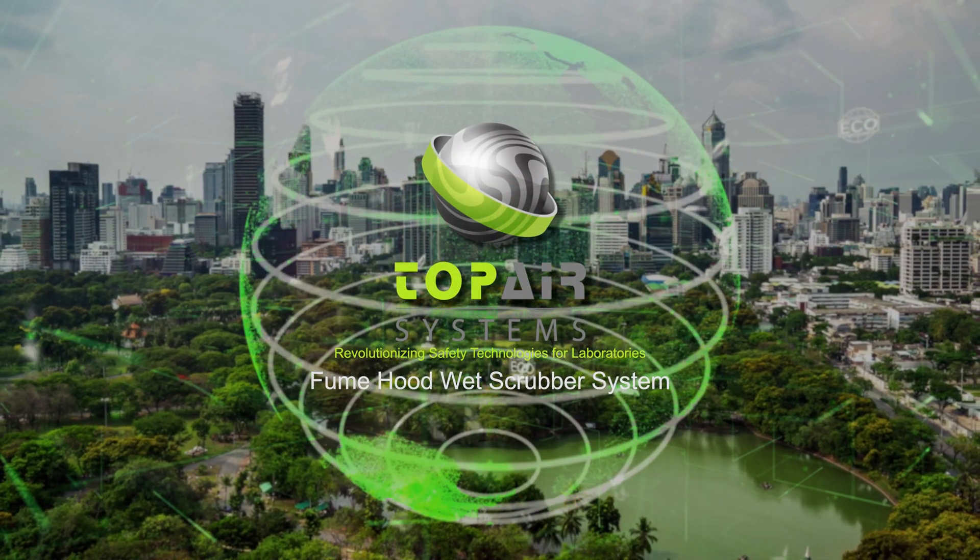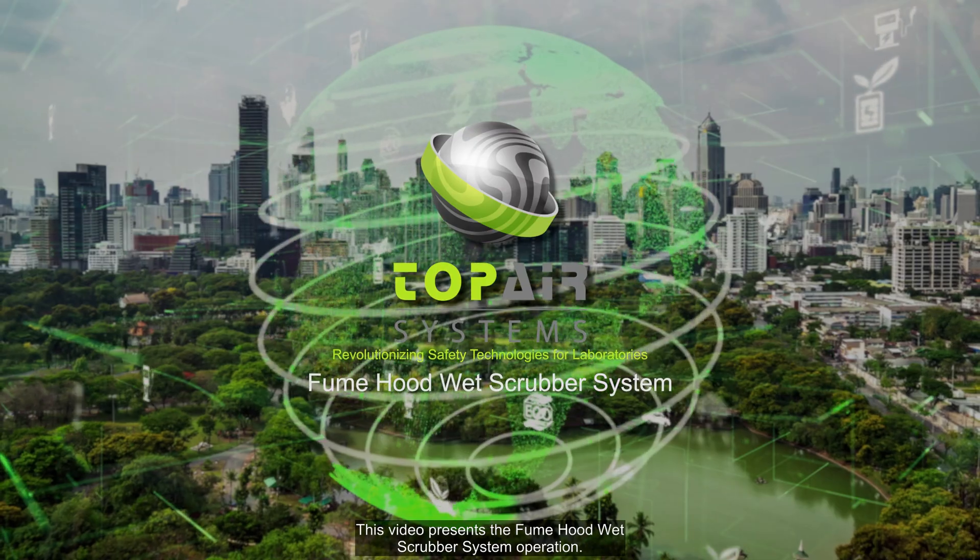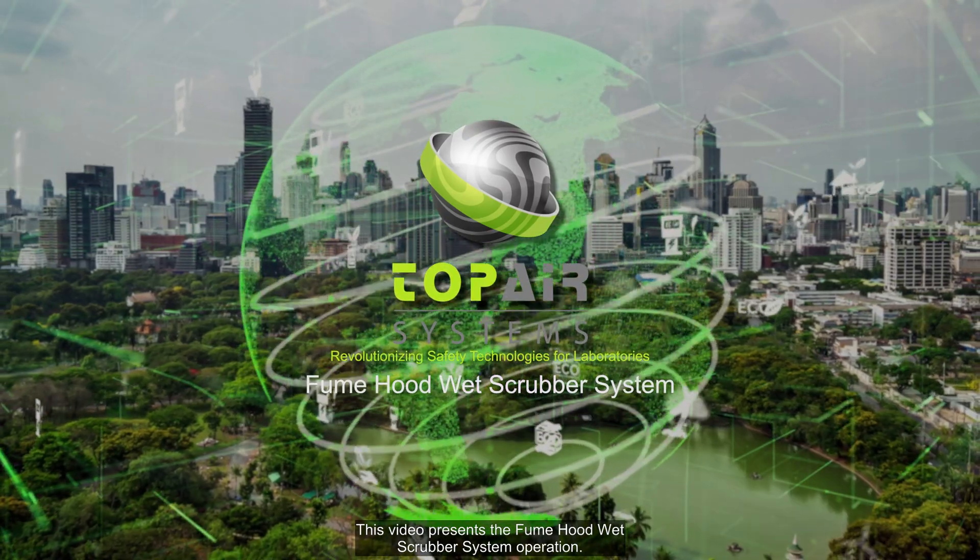Welcome to Top Air Systems. This video presents the fume hood wet scrubber system operation.